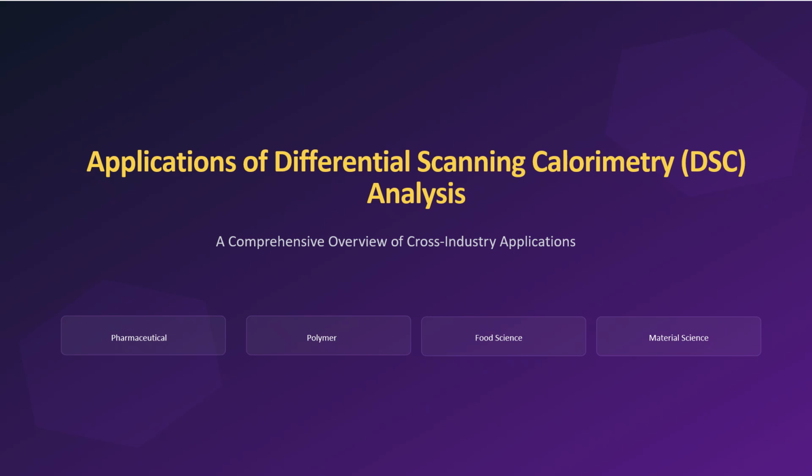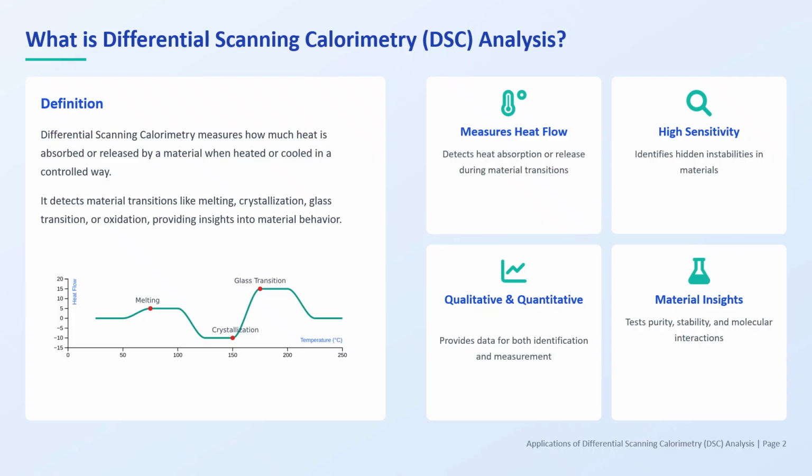Differential Scanning Calorimetry, or DSC, answers that question. Today, we'll explore how DSC works and how it is applied across pharmaceuticals, polymers, food science, material science, and biotechnology, focusing not just on theory, but on how scientists actually use DSC to solve real problems.